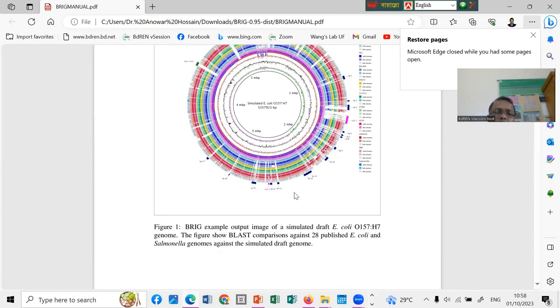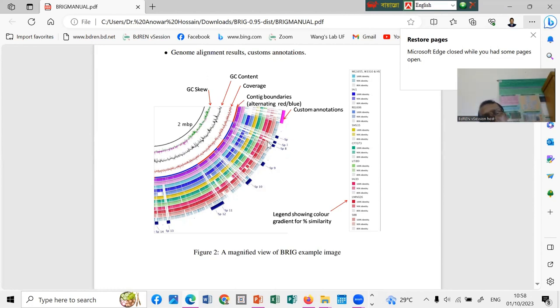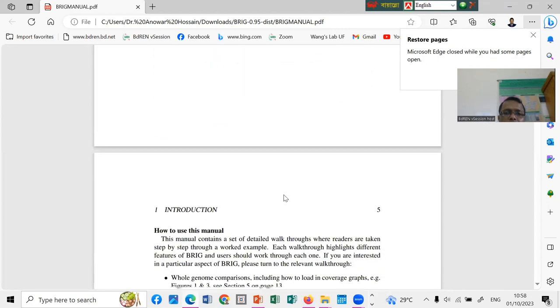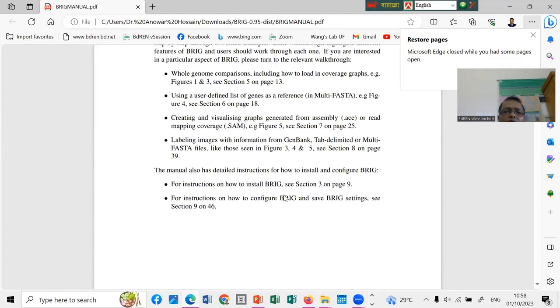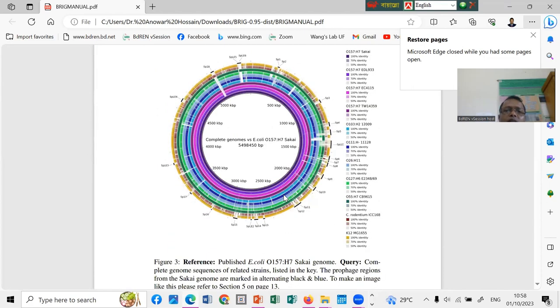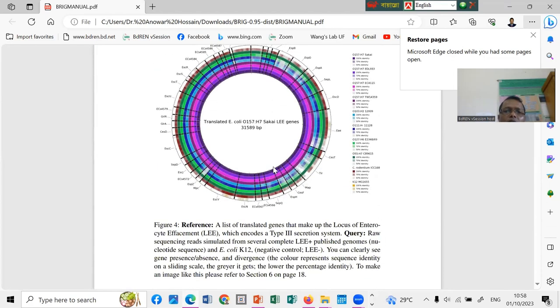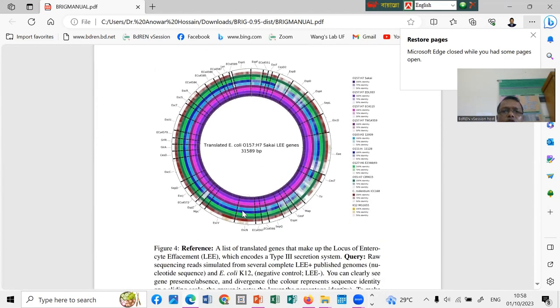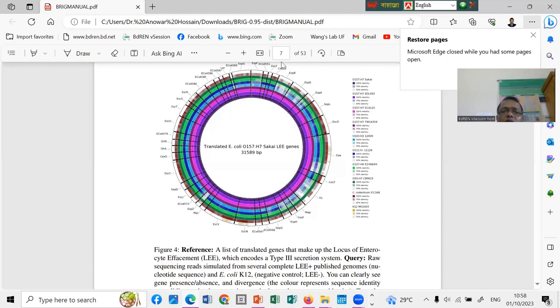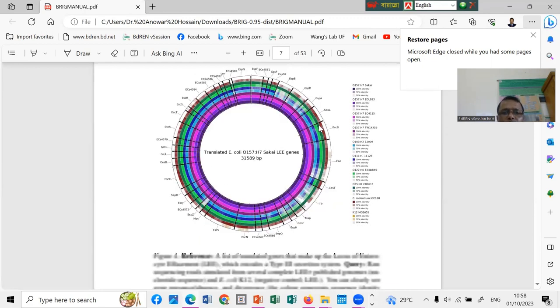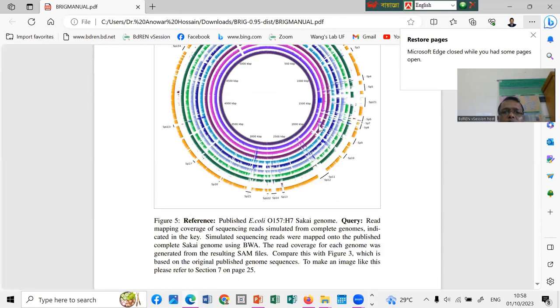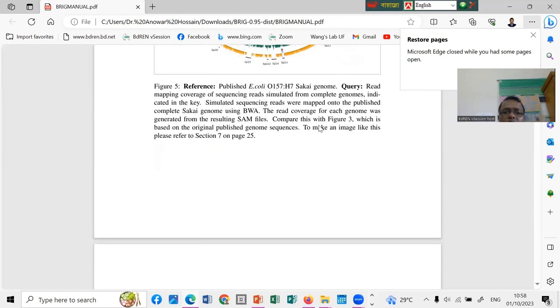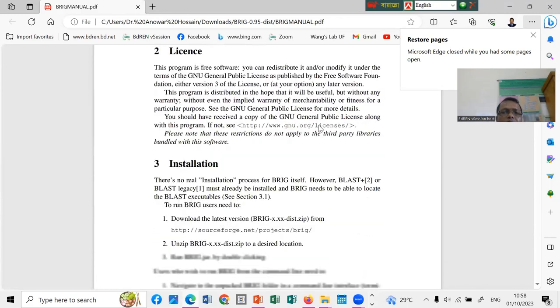So, that means you can see different ways. How much the GC skew, GC content, coverages, quantity boundaries. And also what is similar and what is different. You can also from here download the blast. So, this is the reference. They already showed you the different gene shown in the competition. During the competition. And if you want to show the particular gene, you can also. So by this way, you can use these BRIG. And after that, just from here you can download the blast.